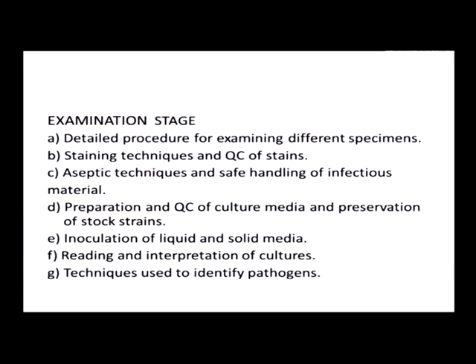Then interpretation of cultures after overnight incubation. Most of the time it is overnight, sometimes it may be even 48 hours if it is a slow growing organism, or sometimes like in tubercle bacilli it may be weeks. Then how you are going to identify, so whether you are going to use microscopy or a set of biochemical tests, whatever you are going to use, that has to be kept in mind.